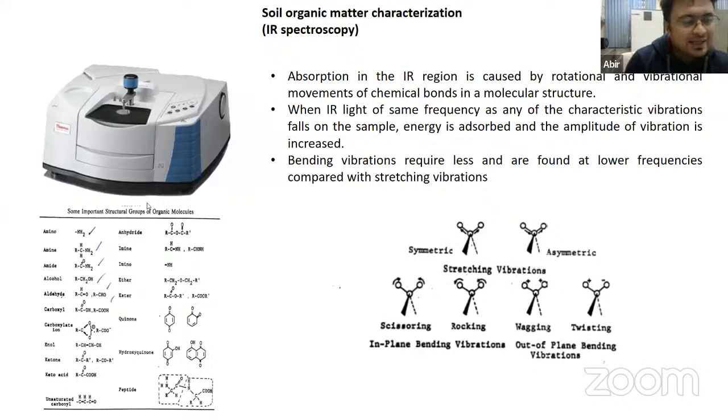So that actually tells us a lot about its structure, how that humic acid is formed, and mostly the condition of that field. Means obviously the effect of some treatments. So we can tell the quality of that carbon just by studying the humic acid structure, characterizing those humic acids. So an easy and very good way of studying the humic acid characteristics is infrared spectroscopy.